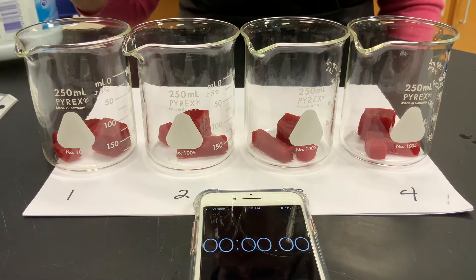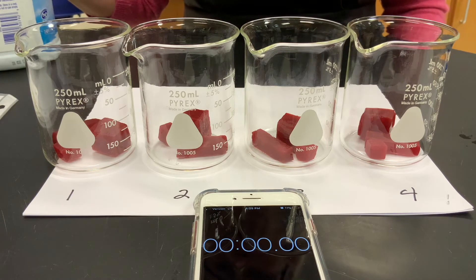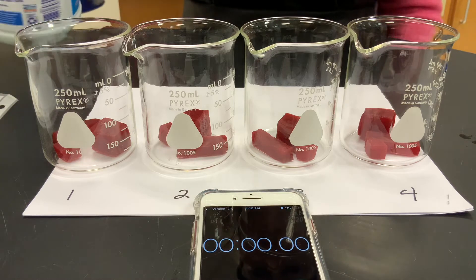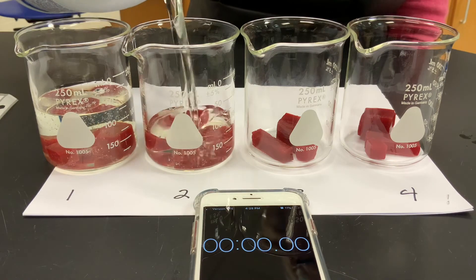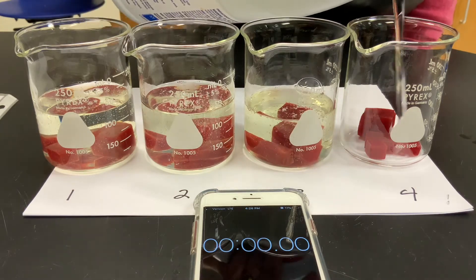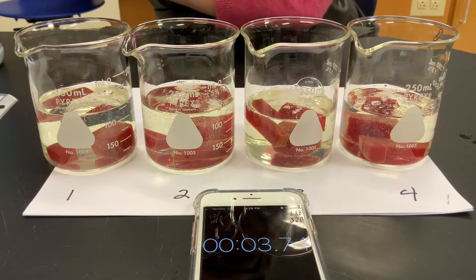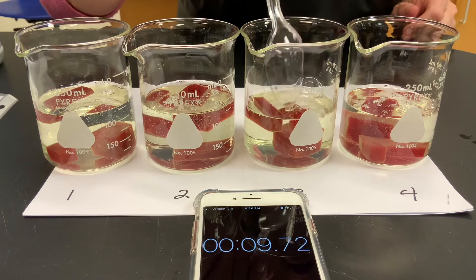We have 1 by 1 by 1 centimeter cubes, 1 by 1 by 4 centimeter prisms, and a 2 by 2 by 2 cube. I'm going to cover them with bleach, start the timer, and then we are looking for the time when each one is completely white.